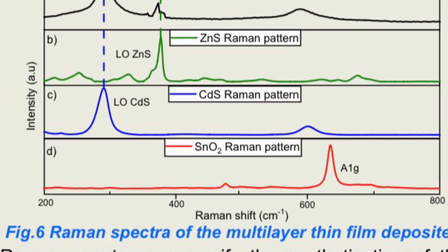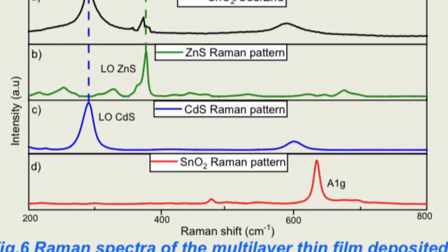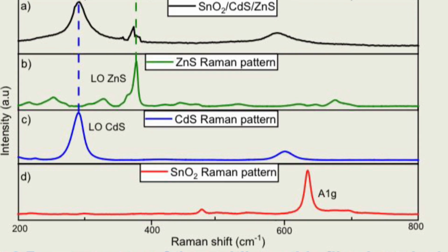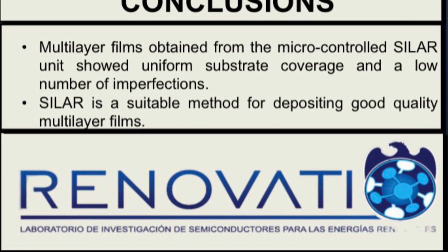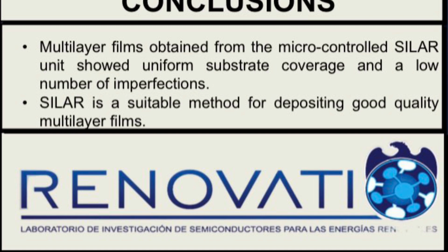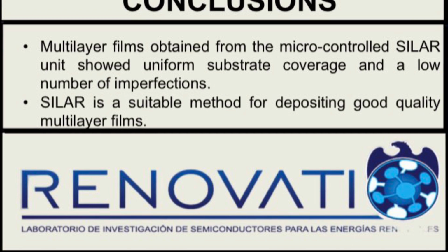Finally, we can see here the Raman spectra for the multi-layer structure synthesized, and the Raman patterns for the compounds alone. We can observe the characteristic longitudinal phonons for the zinc and cadmium compounds, and we can confirm that chemically there are no subproducts in the thin films.